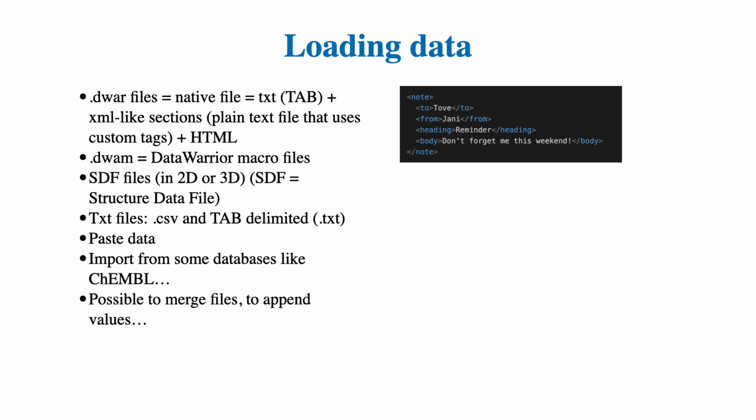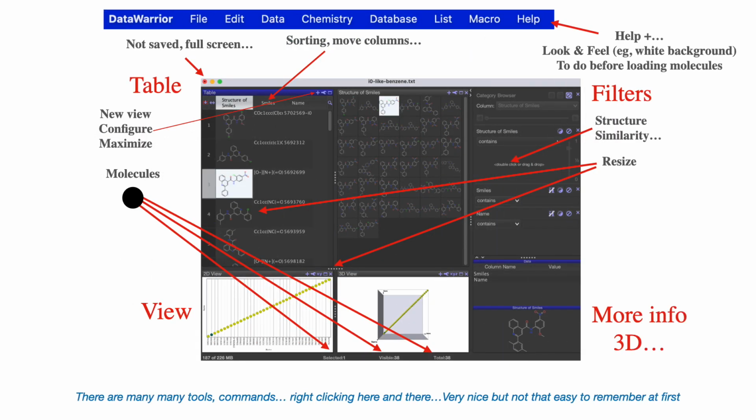Before diving into the details, it's important to take some time to get familiar with DataWarrior's graphical interface. The software offers a wide range of features and options, many of which are not immediately visible. You'll find the different areas of the interface respond to mouse clicks in various ways. Clicking certain parts can open pop-up windows with additional tools and functionalities that are not listed directly in the main menus. The interface is also highly flexible.